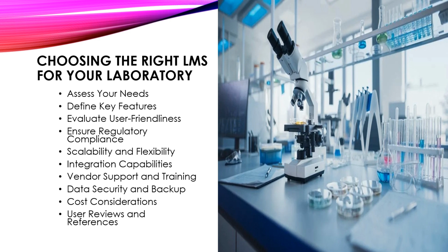Vendor support and training. Evaluate the level of support and training offered by the laboratory management system vendor. Adequate training and ongoing support are essential for successful implementation and adoption of the system. Data security and backup. Ensure that the laboratory management system has robust security measures in place to protect sensitive patient data and laboratory information.